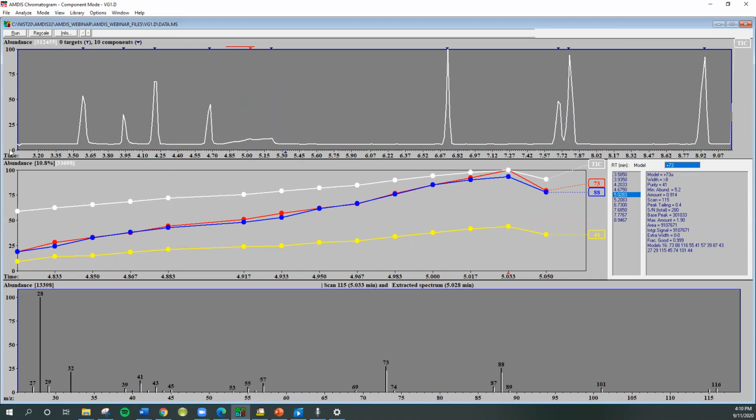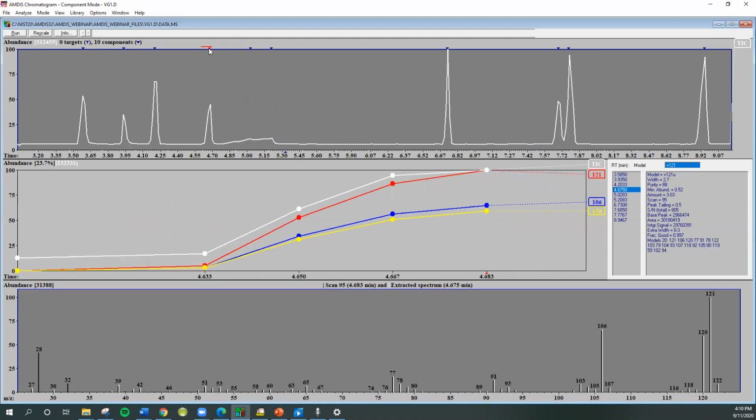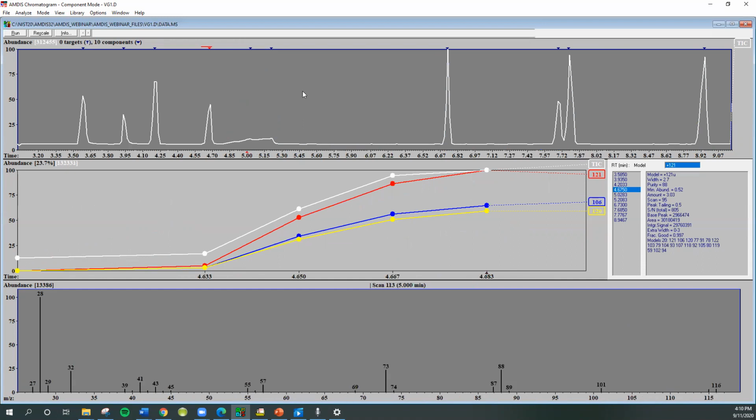This middle chromatogram, really, is what ions it tried to use to model where the peaks were. So it plots this automatically, and you could make this window go away, but I like to see that it's working properly, so I just leave it on, just because it's such a central part of the program. So that's pretty much the whole Windows display here.